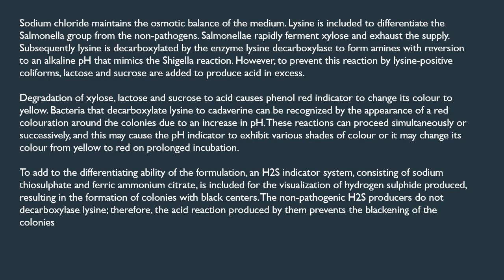So an isolate like Salmonella, which decarboxylates the lysine to cadaverine, can be recognized by a red coloration around the colony due to the increase in pH.